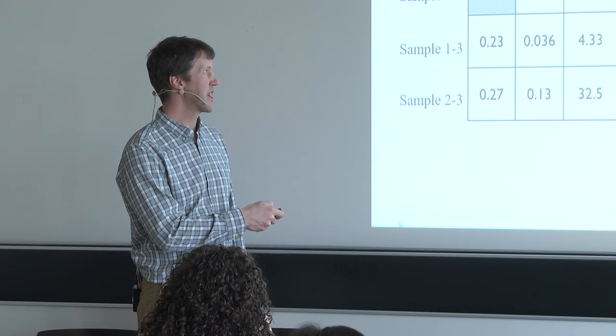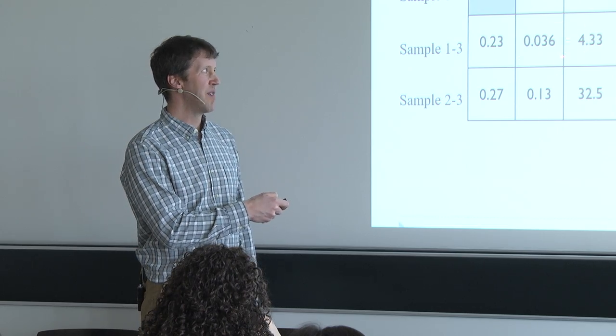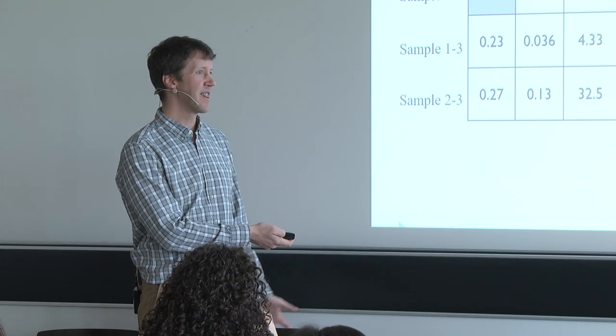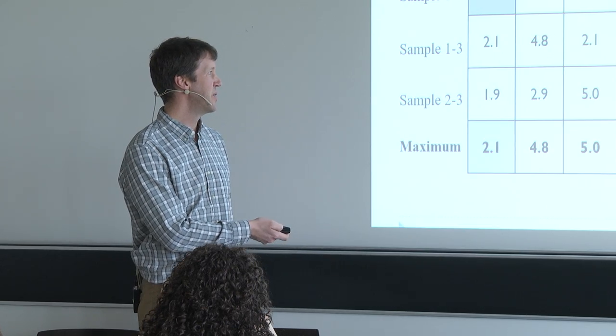Whereas in other cases we have much more extreme fold changes, and we really should expect Skyline and other tools to be able to find those.